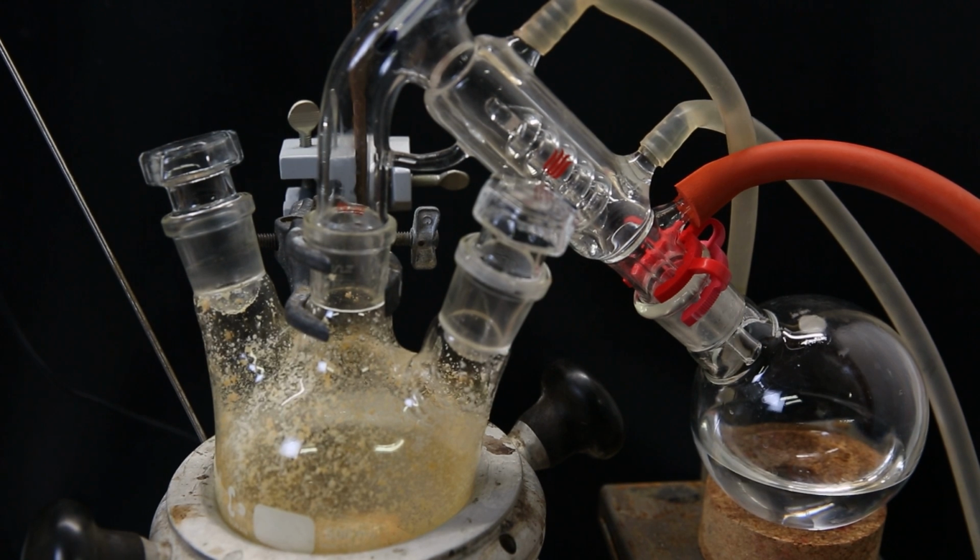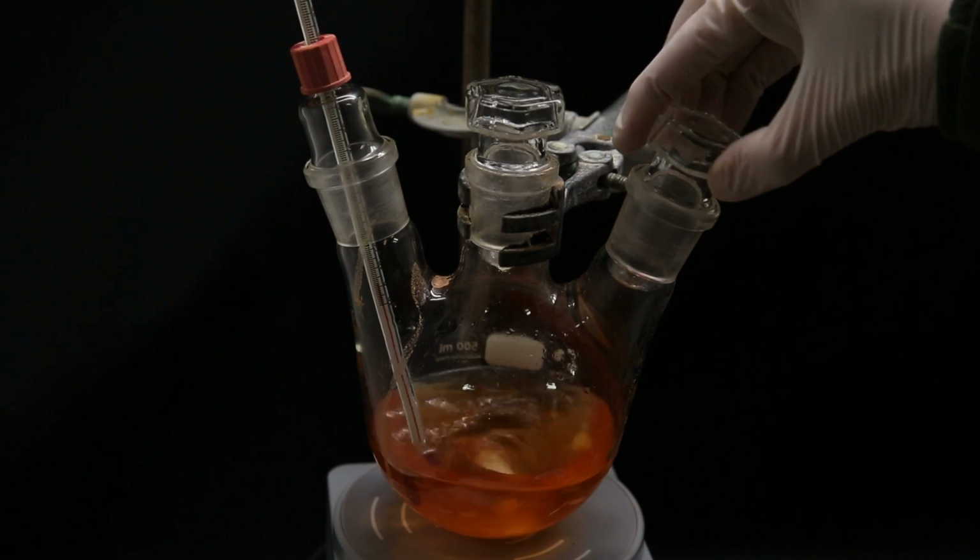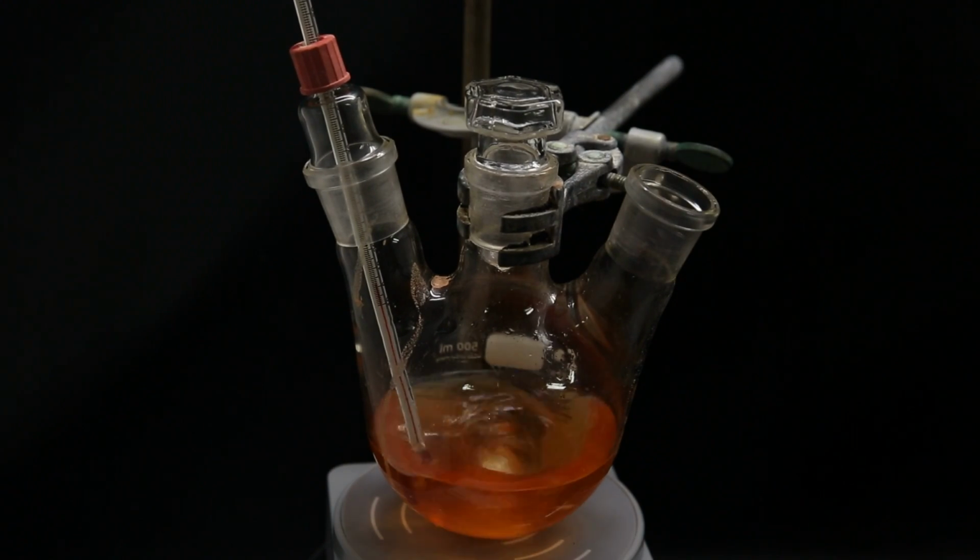When all of the methanol has distilled over, a yellow-orange solid is left behind. I then redissolved all of it in about 100 ml of methanol to give a red solution of the product. Now I set the flask on a stir plate and added a thermometer and adapter.